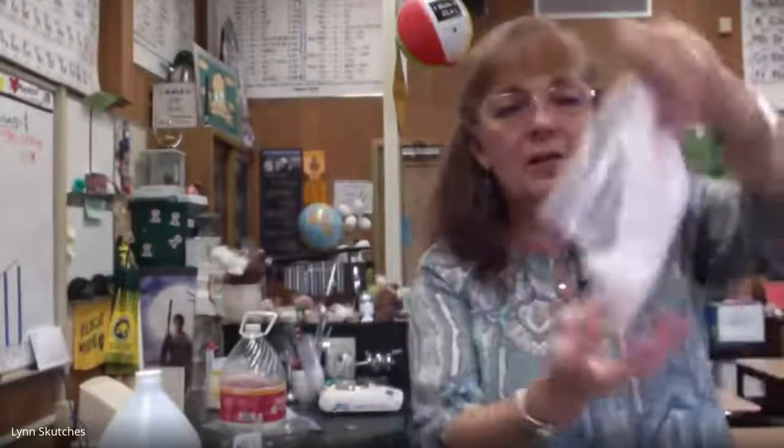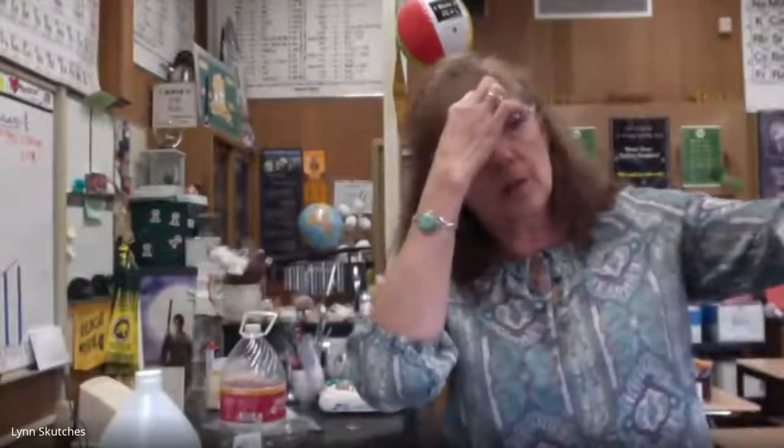What you're going to want to do is get that thermometer bulb into the fizzy stuff and watch what happens to the temperature. So you should have a starting temperature before you tip it. So just be careful. Oh, you can see, this one's sealing better. The bag I used last period did not work. So it should be fun. It should be entertaining. Just make sure you rinse everything off when you're done. Set it aside to dry.